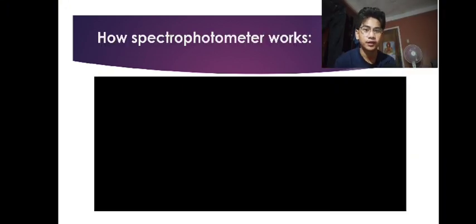Since you already know the fundamentals and quantitative applications of UV visible spectrometry, I have here presented a video of how a spectrometer works.